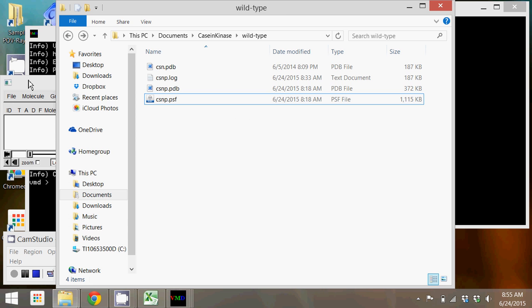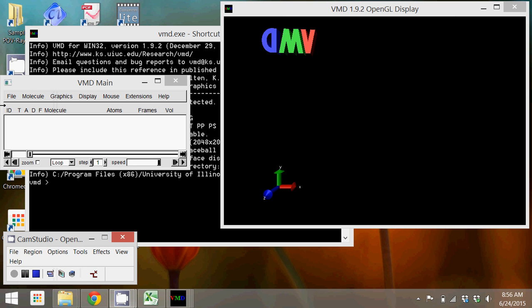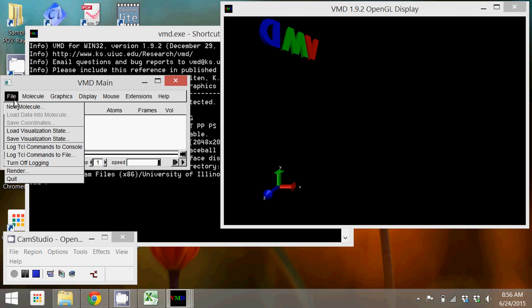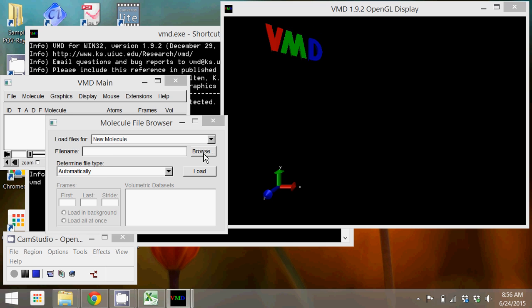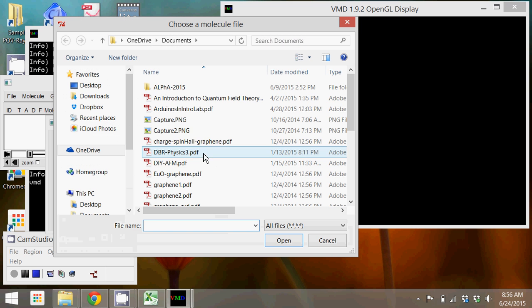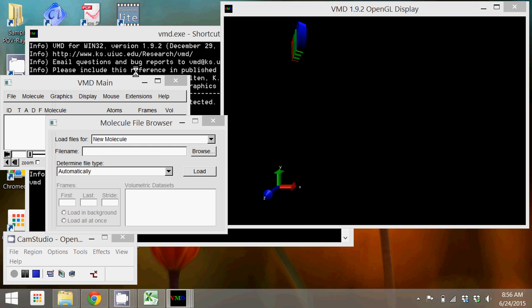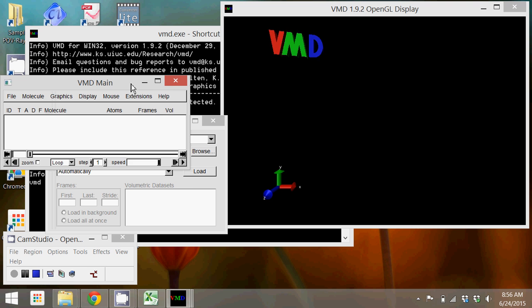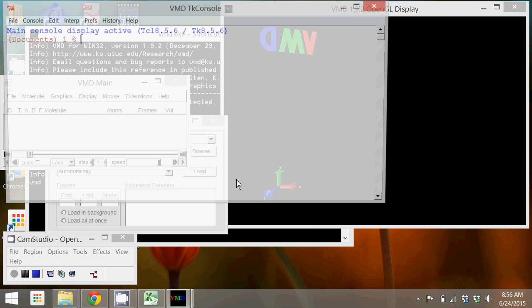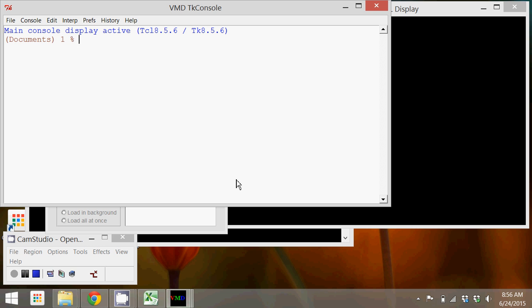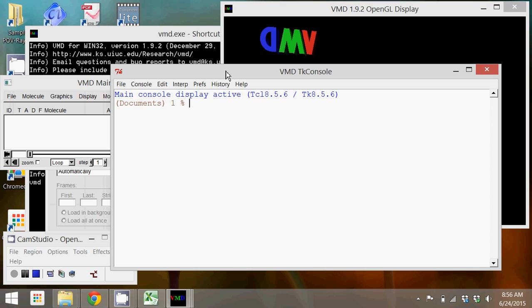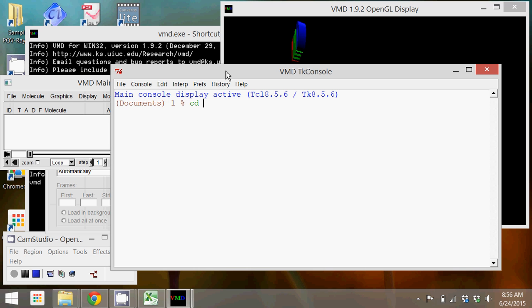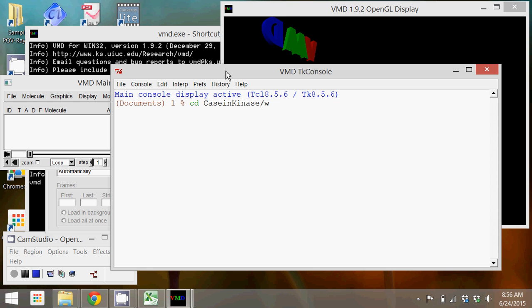So what I'm going to do is load that structure file. Before I do that, I'm going to set my directory in the console window. So under the extensions menu open TK console and I'm going to change directory into where I'm working, which is casein kinase and then a subdirectory wild type.